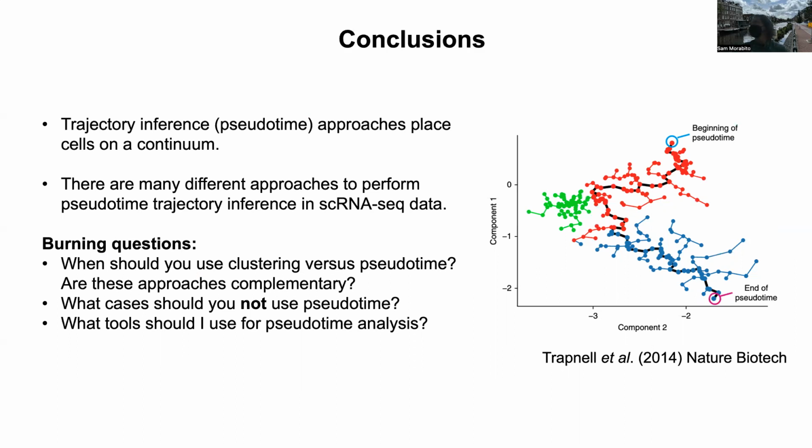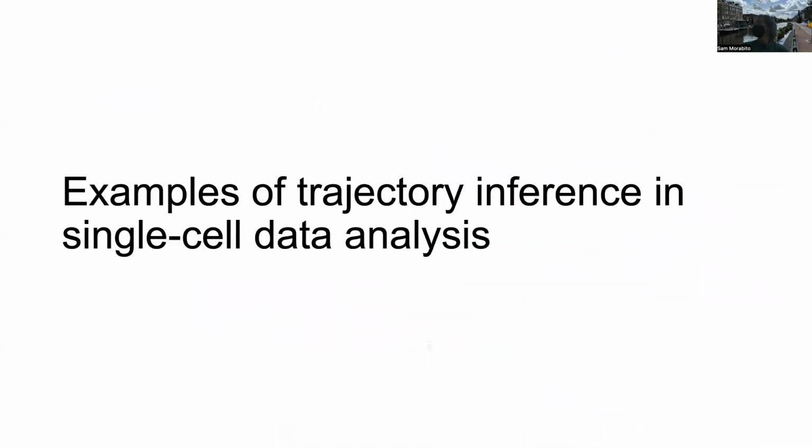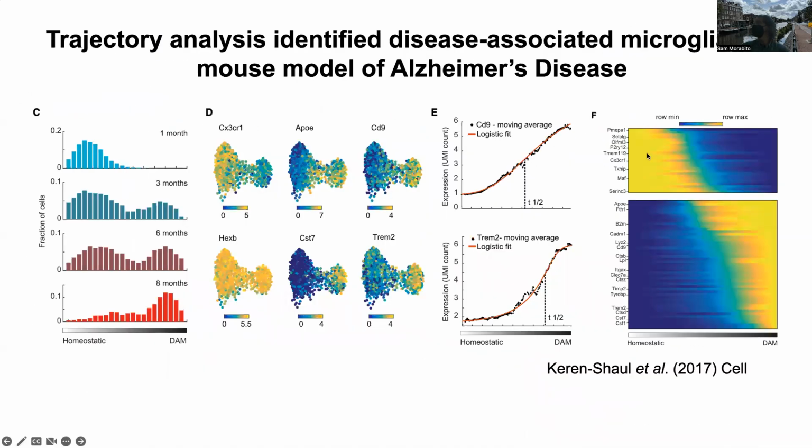There's also a lot of downstream things you can do once you have the pseudotime, like basically doing a differential expression test where your variable isn't group 1 versus group 2, your variable is the continuous pseudotime, right? Monocle 3 has a module to do that built in. So overall, I think Monocle 3 is a pretty good end to end tool, it does everything I need it to do.